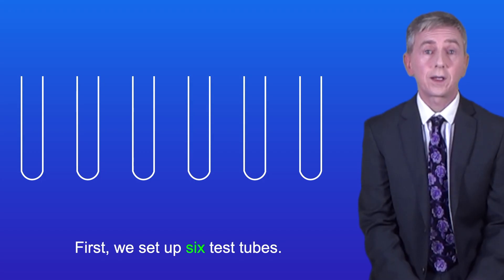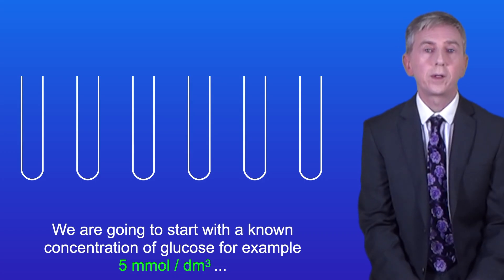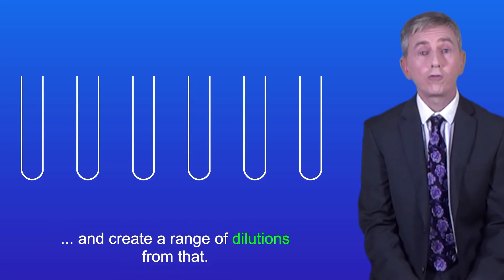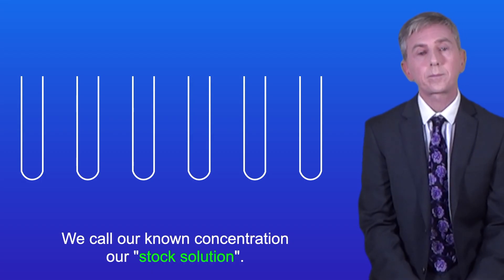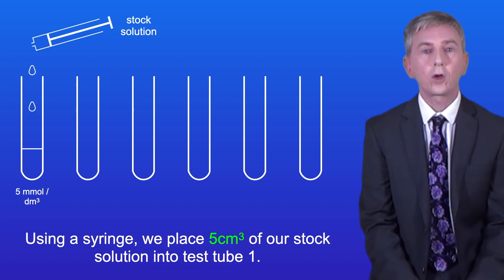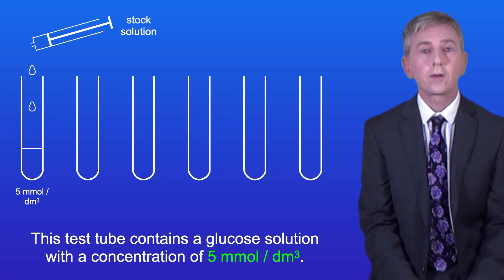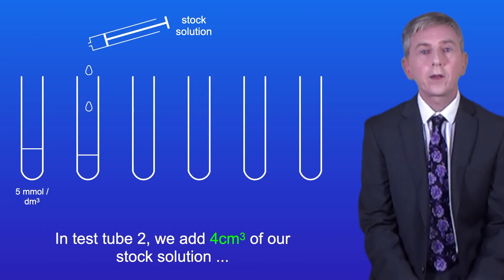First we set up six test tubes. We're going to start with a known concentration of glucose — for example, 5 millimoles per decimeter cubed — and create a range of dilutions from that. We call our known concentration our stock solution. Using a syringe, we place 5 centimeters cubed of our stock solution into test tube 1, which contains a glucose solution with a concentration of 5 millimoles per decimeter cubed.